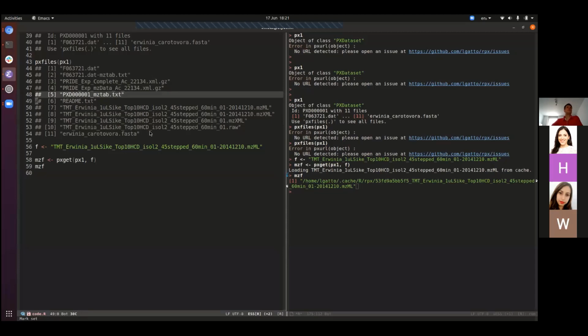You might also get identification data, quantitative data, depending on what the people have submitted. But that will still require some manual exploration, because I checked a couple of them and none seem to provide, in an easily understandable way, information about the samples.